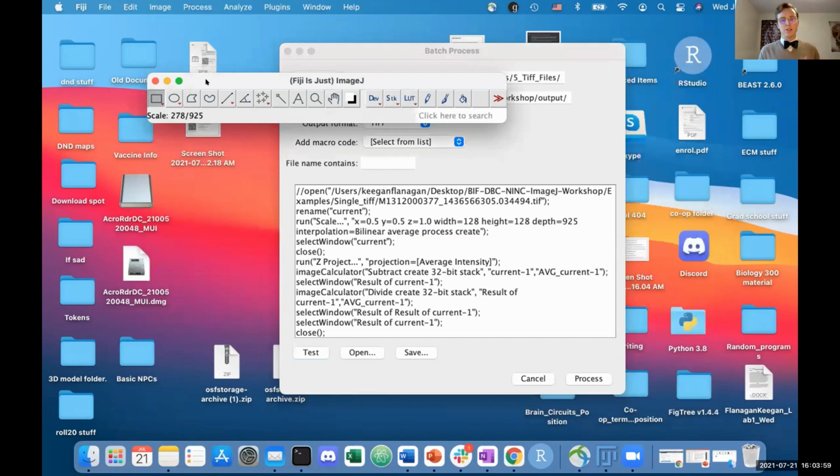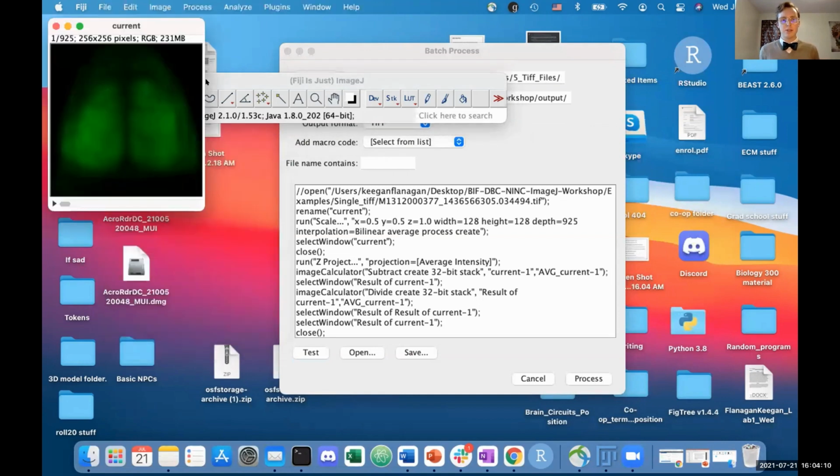All right, so this is going to take a few minutes to run through all of these scalings and redoings and stuff like that. So if anyone has any questions, now would be a good moment.